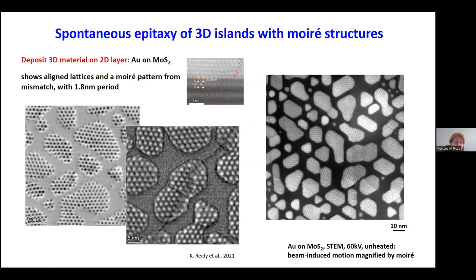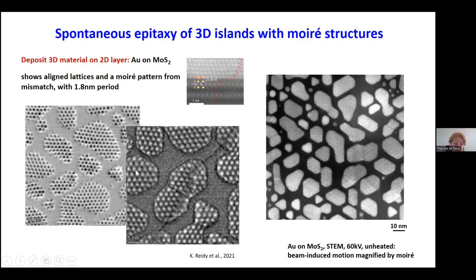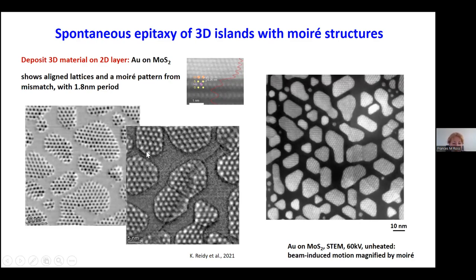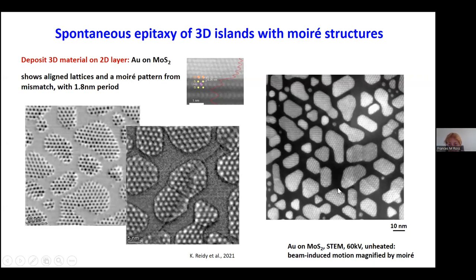Here's an example where we've grown gold on MoS2 — my favorite pair of materials for this application because they give such beautiful images. You can see the MoS2 lattice structure just about visible in the background. The gold structure on top isn't visible in itself, but there's a fabulous moiré pattern between the gold lattice and the MoS2 lattice. In cross-section you can see that the lattice parameters are quite different, and the resulting moiré pattern's regularity tells us that the gold is epitaxially arranged on the MoS2. The shape of the faceted islands tells us about the energetics of different facets. Even at room temperature imaging, there's a little rotation caused by the electron beam — the islands are very poorly, weakly bonded onto the substrate, just like those gold triangles on graphene shown at the beginning.